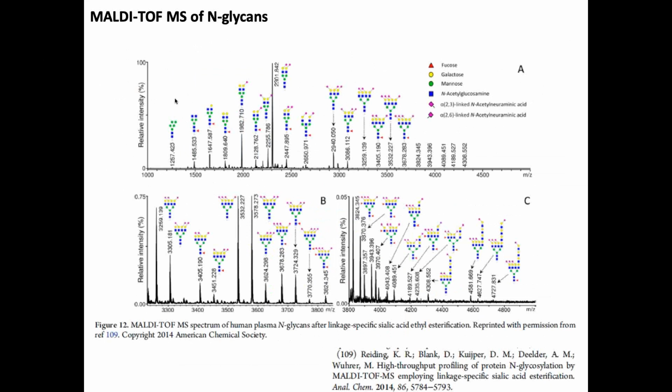Okay? And so when we start talking about reducing end derivatization of N-glycans, if you look at the cursor, I'll show you, right down here, this is the reducing end of this glycan, the blue box. That gives you a free reducing end, which you can then put a tag on, and that tag can, in our case, have a stable isotope labeled standard, so you can do quantitation.